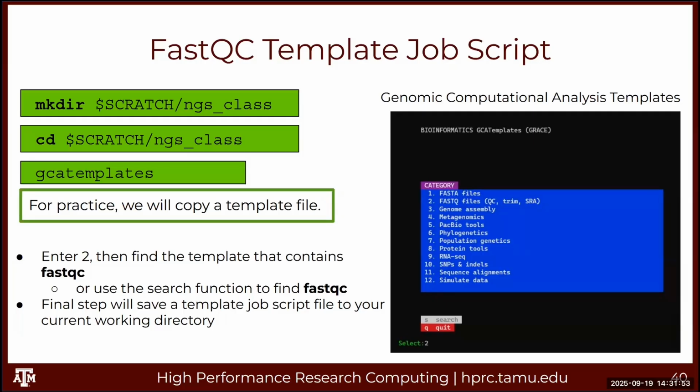I'm going to wait for everyone to get here at this point. Close that. Go to the top of this. Yeah. Off shell X. And then type in these three commands.